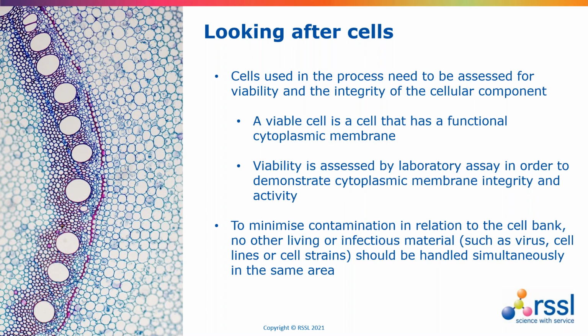We might use cell staining or viability dyes, manual or automated processes, light microscopy or flow cytometry of a cell suspension to look at this.